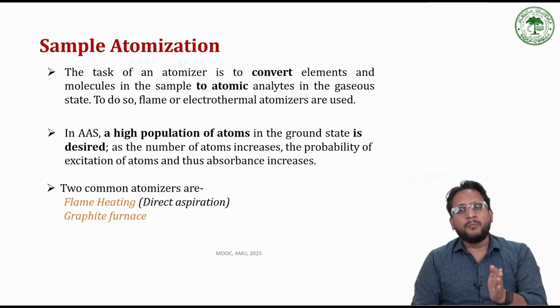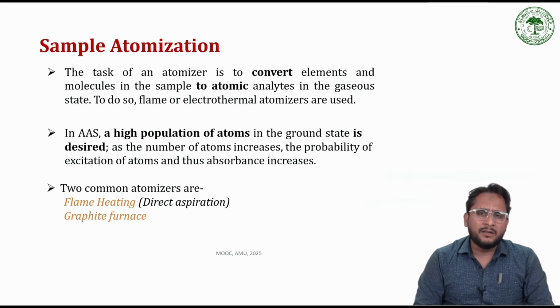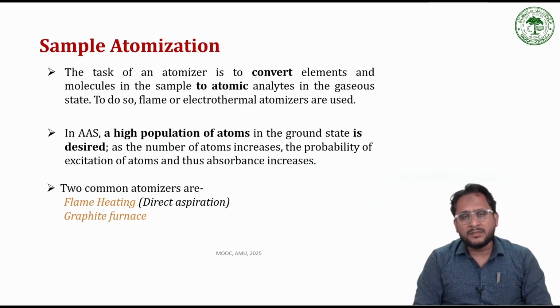So these two components, the nebulizer and atomizer, play the most important role. It doesn't mean that only the light source or the detector is important. Each and every component is important. If the nebulizer is not doing its job properly, if the nebulizer is not converting the sample properly, what would happen?